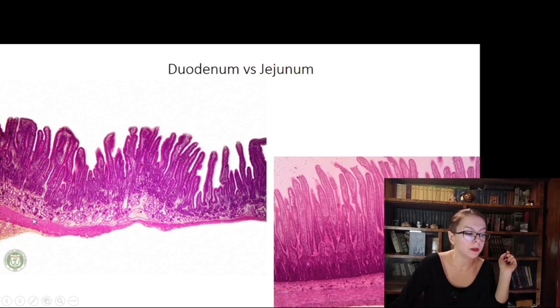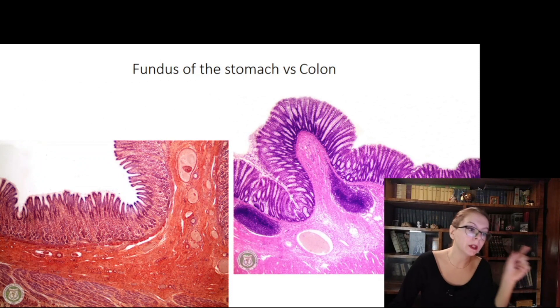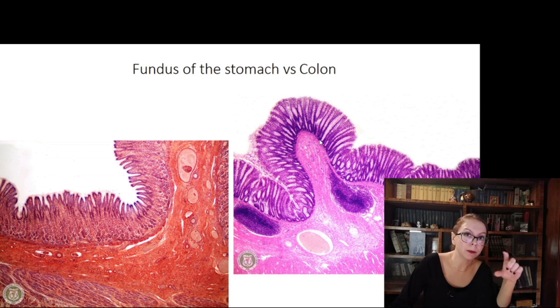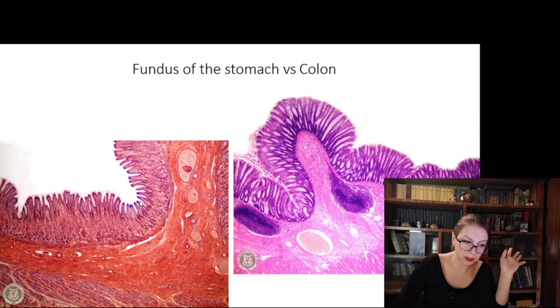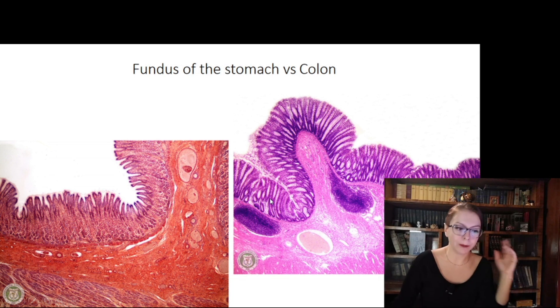The next pair is the fundus of the stomach and the colon — the large intestine. What is similar is that in the colon we have crypts that are linear and parallel to one another, with no villi, and the surface is rather smooth — as in the stomach, where villi are also absent. The tubular glands are unbranched and organized parallel in the lamina propria, as in the colon. How do we distinguish them?